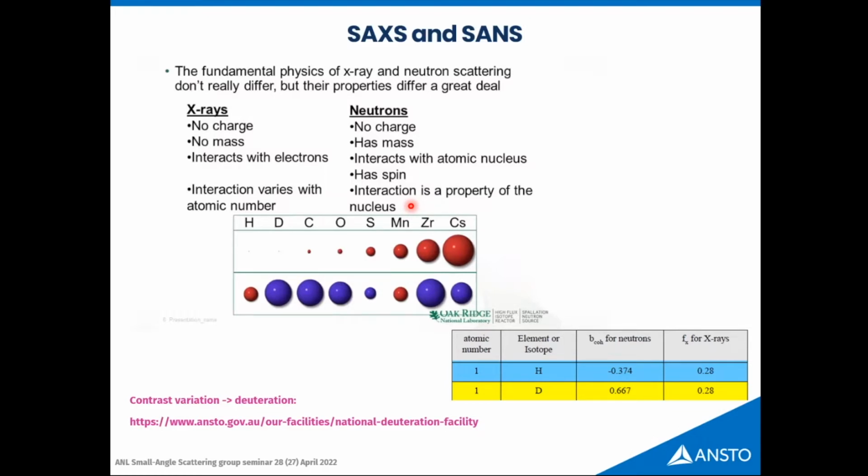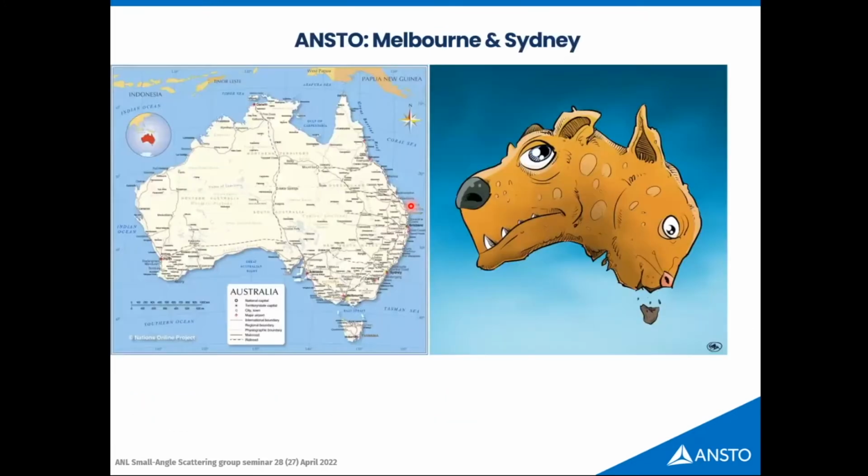Another thing which is quite interesting: our facility is not just SANS, we also have SAXS instruments. So I'll try to cover as much as I can. If it is a bit jumpy and too dense, sorry in advance, but I think it's pretty cool to show. So this is where we are now.